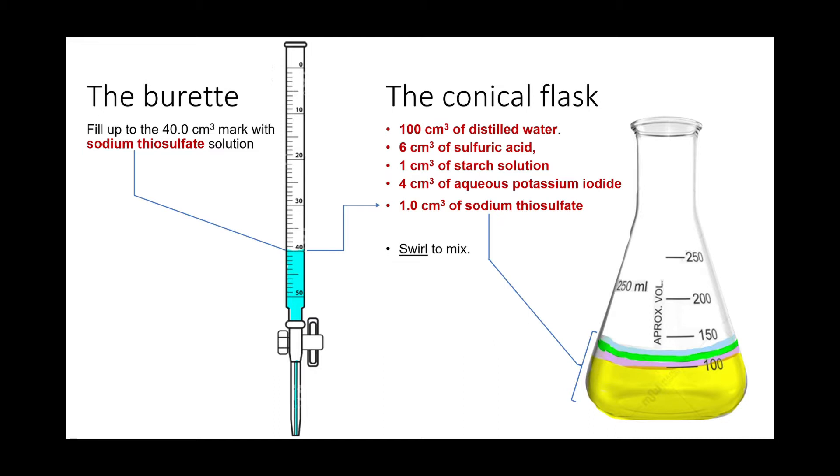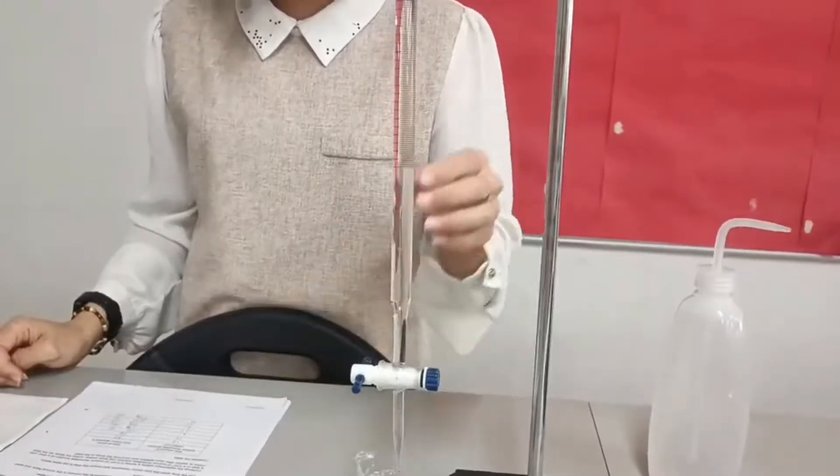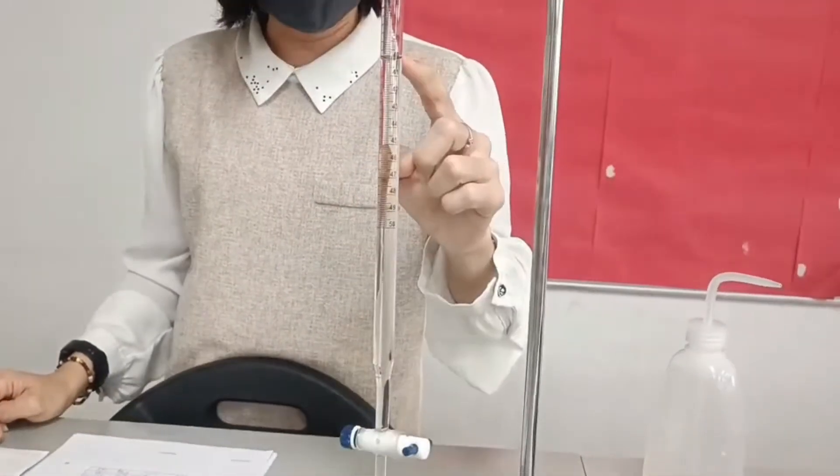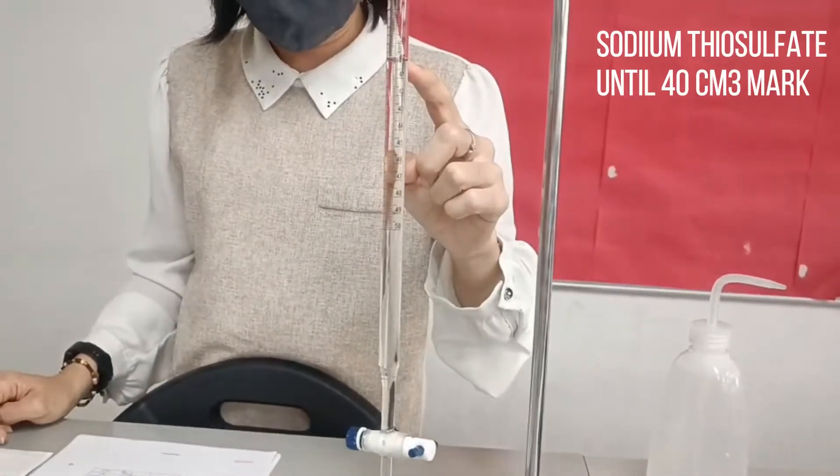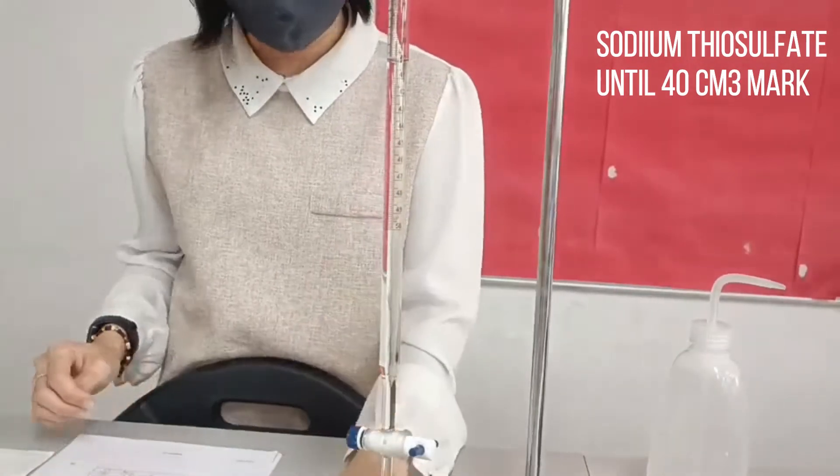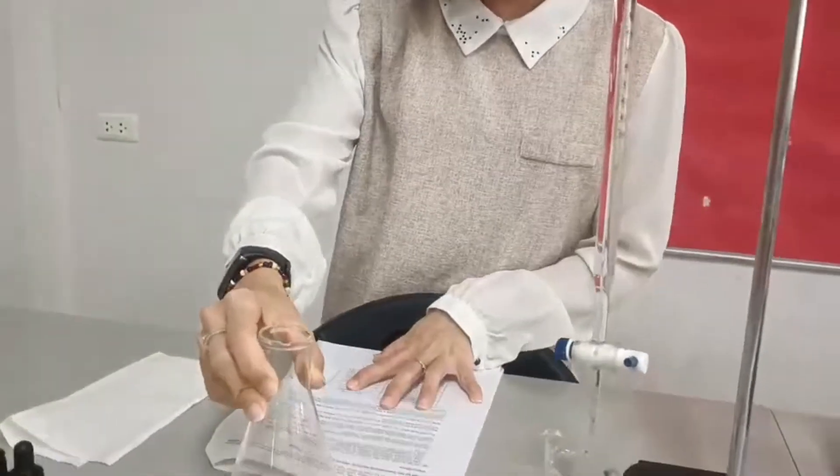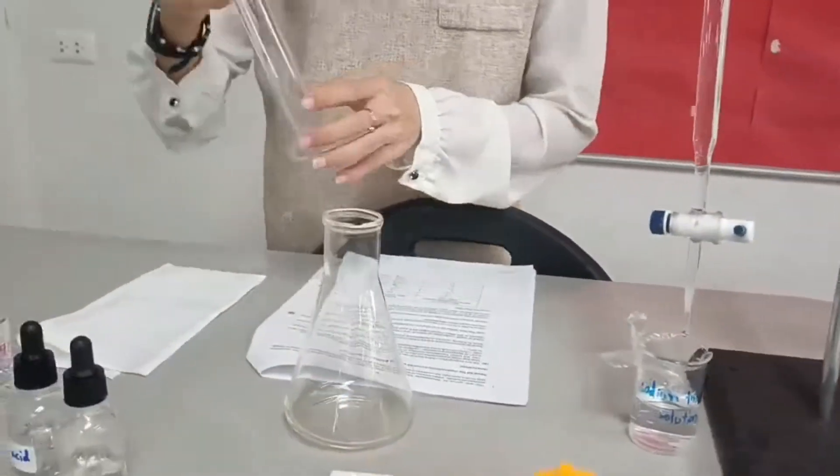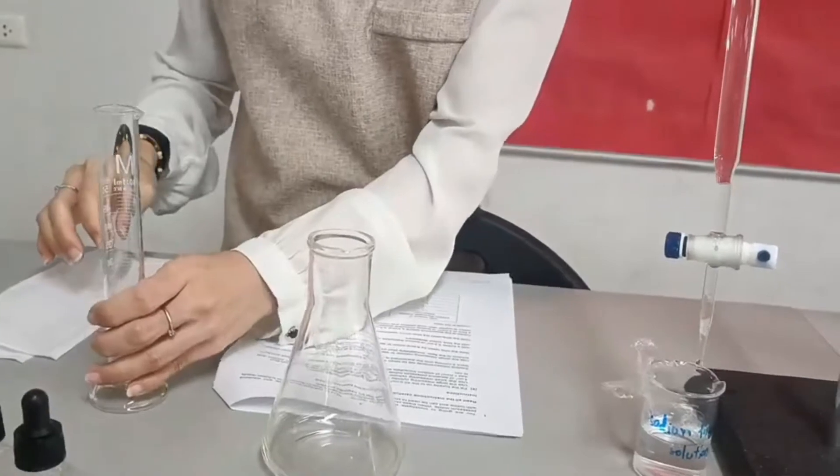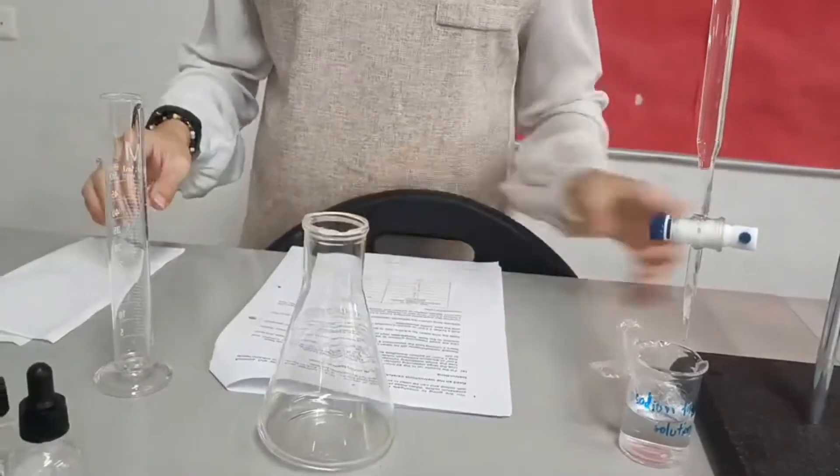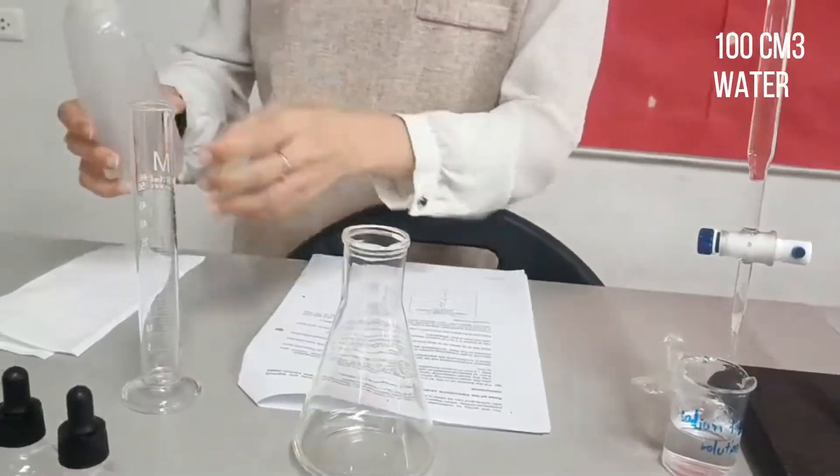The timer needs to run throughout the experiment. I have filled the burette until the 40 cm³ mark with sodium thiosulfate, and now I'm going to prepare the solutions that go in the conical flask. So, here I need 100 ml of distilled water.